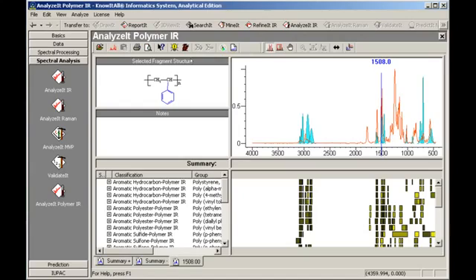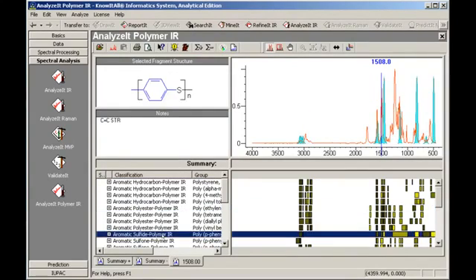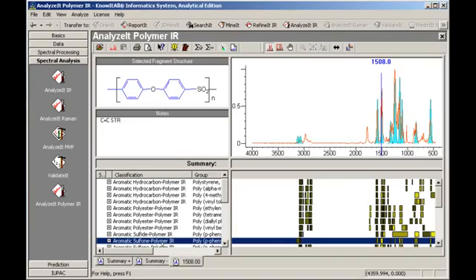The entries in the functional group data pane are listed in alphabetical order by chemical class. As each entry is selected, the corresponding fragment structure and predicted peaks are displayed. This entry appears to be a good match. Right-click to add it to the Summary Plus tab.